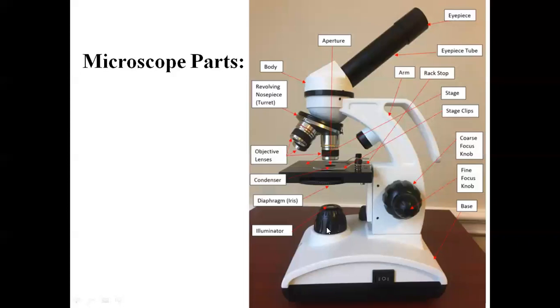You might have seen those kinds of microscopes in your school where this particular thing is absent, and there is a mirror placed so that we can use an external source of light and adjust the mirror in such a way that all the light falling on the mirror enters this diaphragm and is focused on the sample.